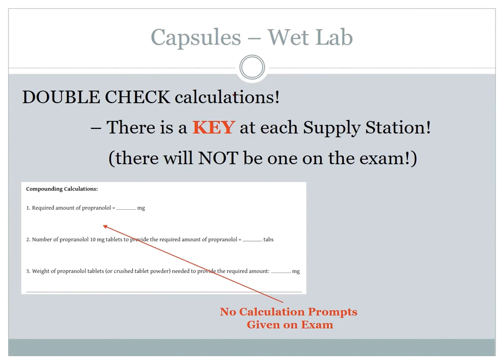Unfortunately, for hydrochlorothiazide, it's not so simple. Just like the indomethacin, the number of capsules is actually excess the amount of powder that you need. So you cannot complete these calculations until you go get the number of capsules, open up and retrieve the powder and obtain the weight of that powder and set up the same kind of proportion as we did for indomethacin. Okay, so just be aware of that.